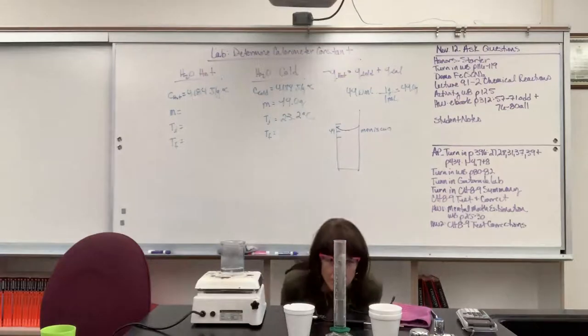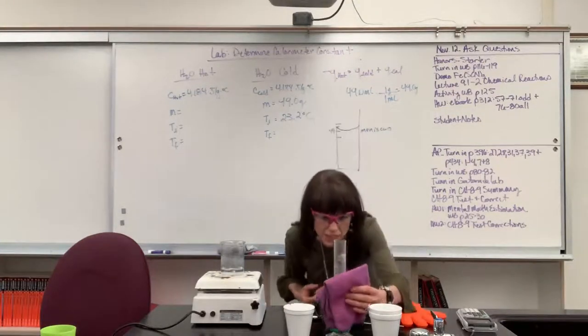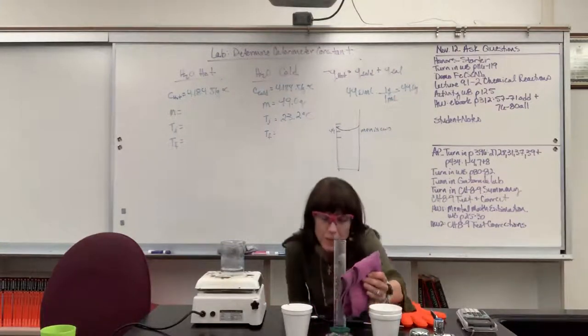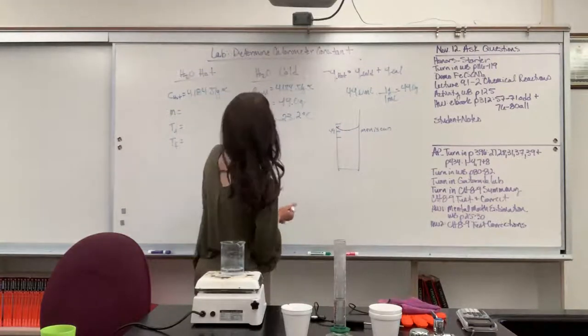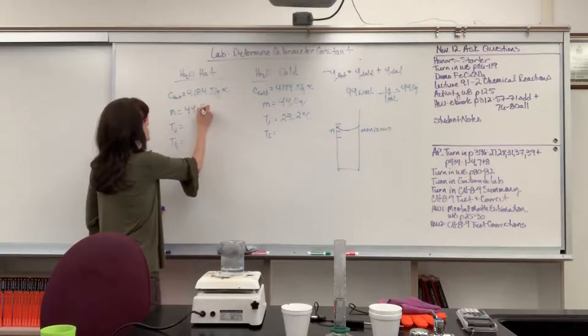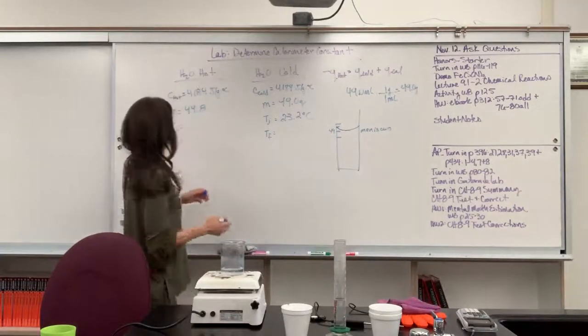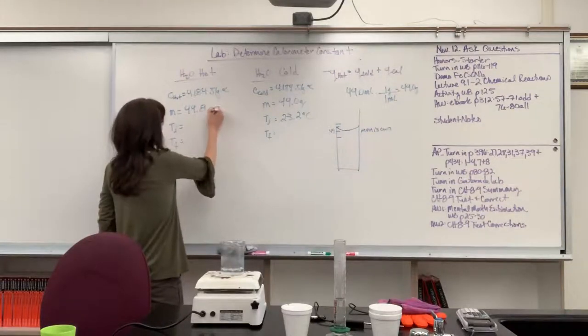Okay, so I'm going to read this. I'm going to go ahead and put the pink behind it just to be sure that I can see those lines clearly, clearly. And I am just a hair under 50, so I know for sure that I've got 49, and my guess is going to be 0.8. It's not quite hitting that 50. So I'm going to say the 49.8 mils is going to be 49.8 grams, okay?